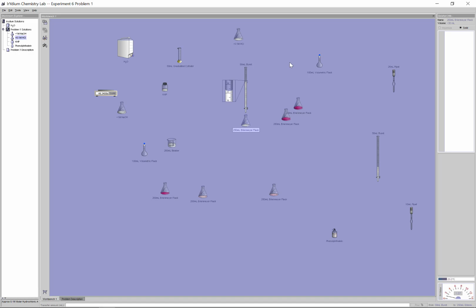Let's see. So 16.71 here. We're going to figure out how much I can toss in safely. From my second titration, I've done this quick subtraction for you here. Looks like we need about 32.37, so we should be okay. Let's just try it out again. I've taken down my starting reading. Don't forget to do that.